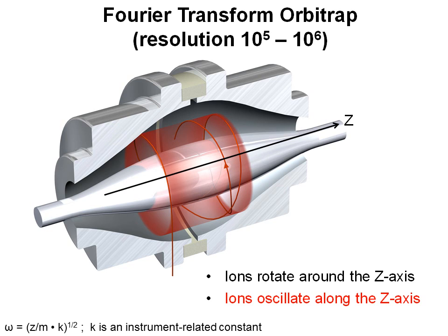Also, Orbitrap mass analyzers have in recent years been combined with quadrupoles before. So instead of having a QTOF, you have a Q-Orbitrap mass analyzer, meaning a quadrupole, a collision cell, and then an Orbitrap instead of a TOF mass analyzer. Such instruments are available also in our laboratory.